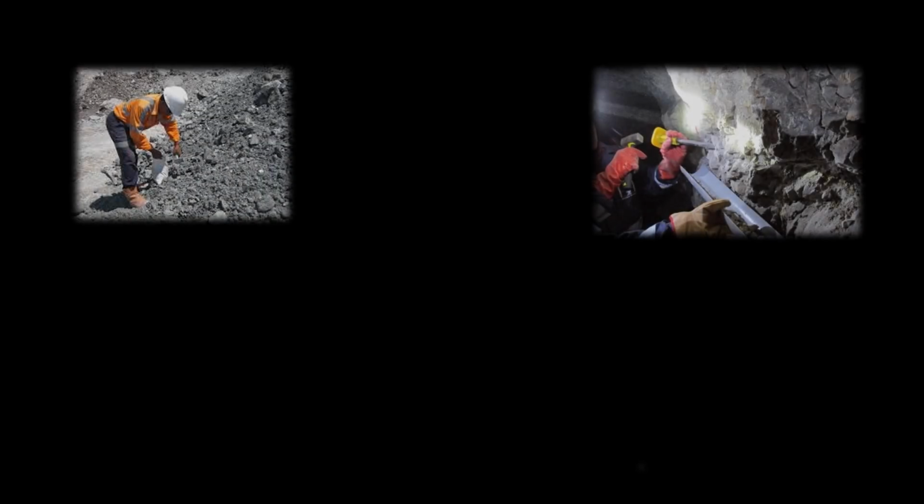As a miner, prospector, or hobbyist, you would collect your samples from the field, meaning from the ground that you are working on or sampling. It would be either placer soils and gravel, or hard rock chips that you've broken off from a vein of some sort. Now these samples will need to be properly prepared.